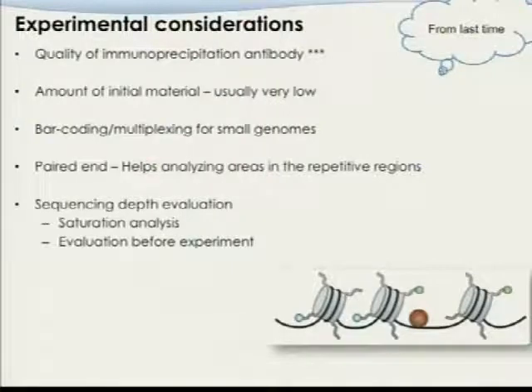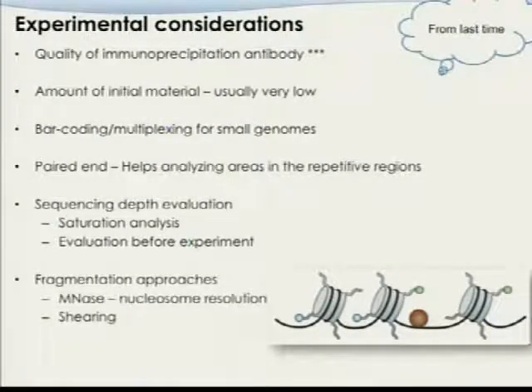And there is also an equation, if you recall, that talks about the evaluation before the experiment. That's an estimation. That basically depends on the genome size, the window size, or the resolution you're interested in, and how significant you want the eventual results to be.